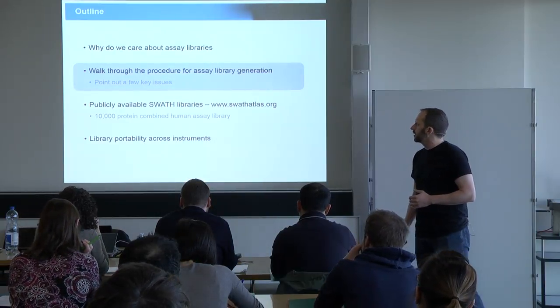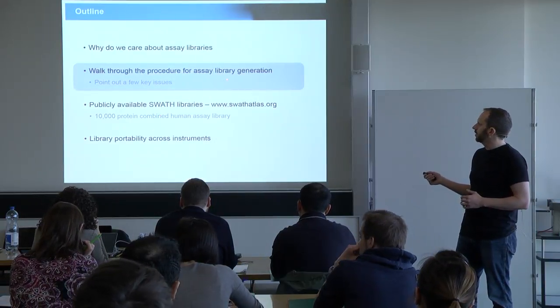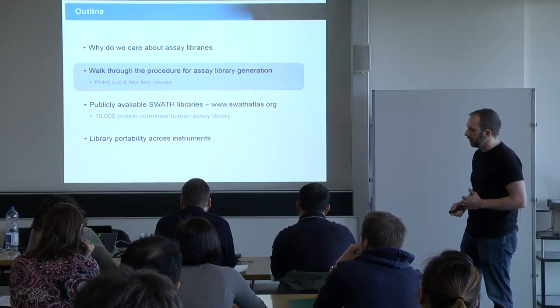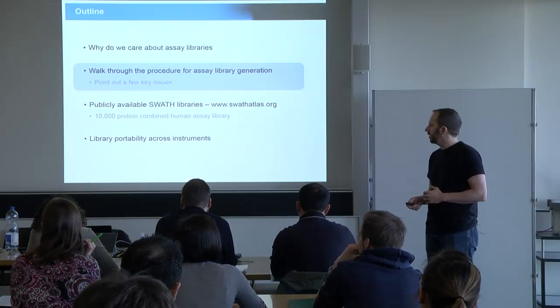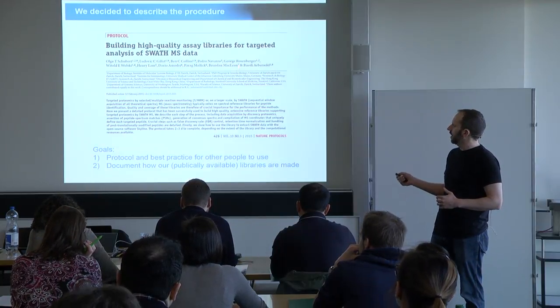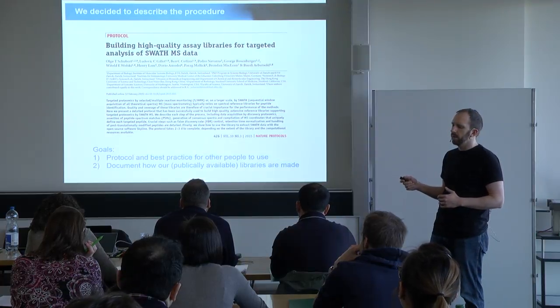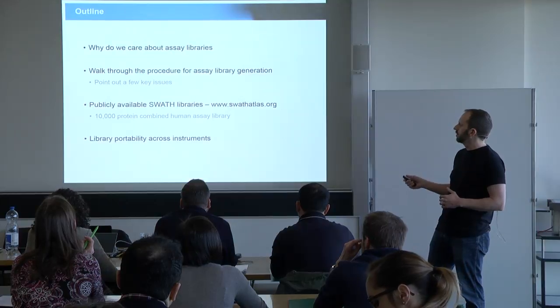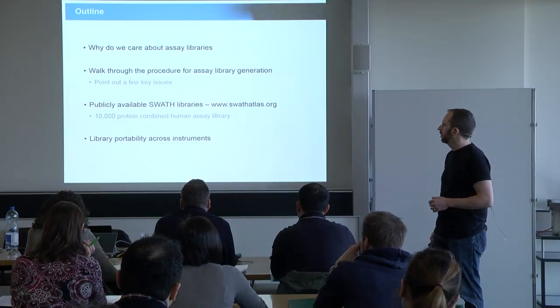So let's get into the actual procedure that we're using, and I'm going to walk down through this procedure and say what happens at each step. It's very similar to this protocol paper, but there's much more detail in the paper, obviously, and I'm just going to try and point out a few things that we think are important.